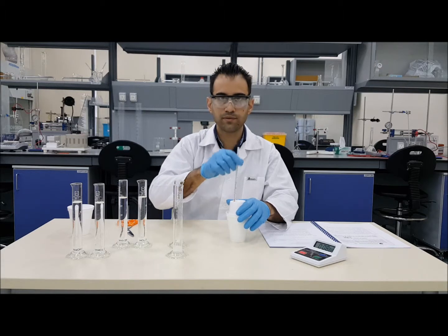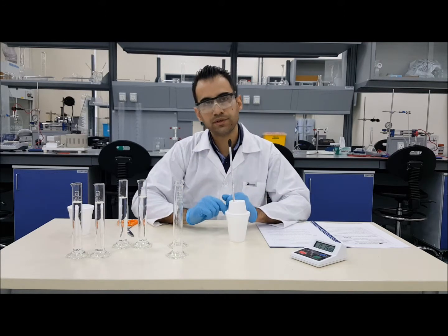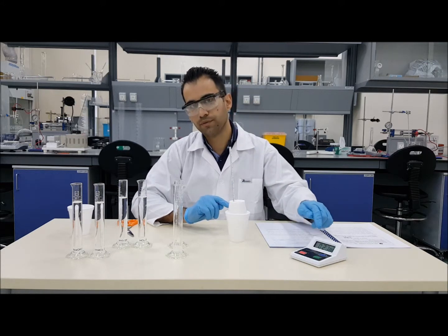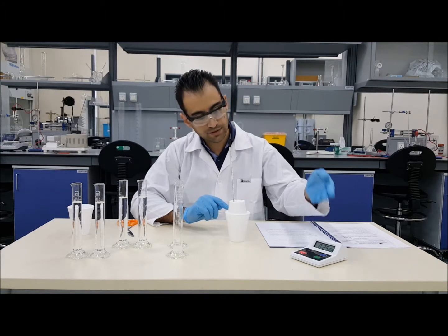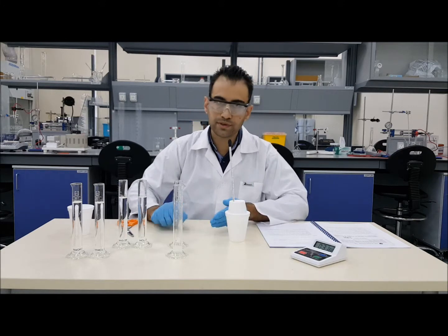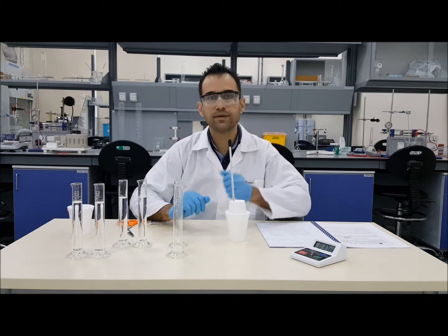You can use the thermometer to do some stirring to make sure that the chemical is mixed up. Now you will need to get a temperature reading every 30 seconds based on the stopwatch. So you don't need to stop the watch every 30 seconds. Just wait till it reaches 30, something like now, for example. You note down the temperature, you wait till it reaches 1 minute, 1:30, 2 minutes, and so on, as per the sheet requirements.